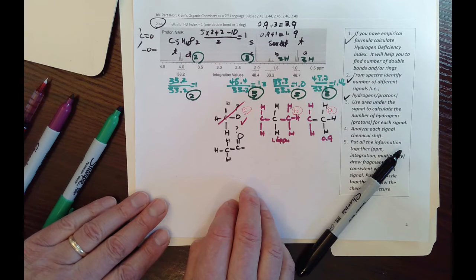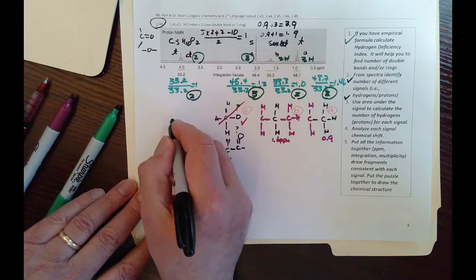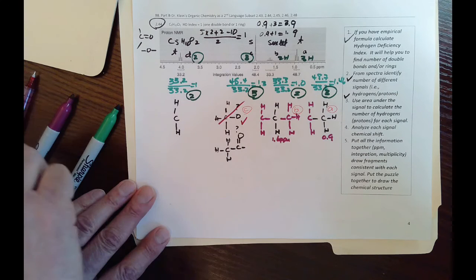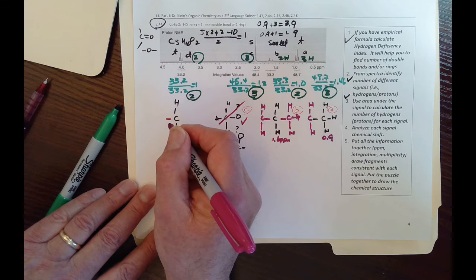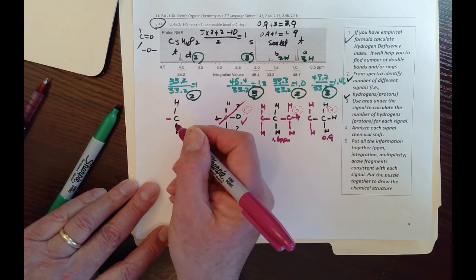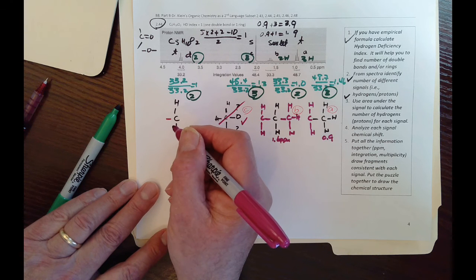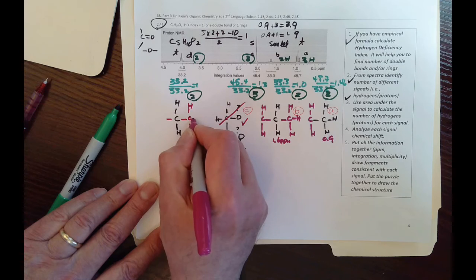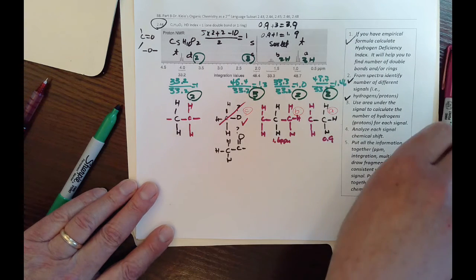Now we're going to look at the D. So D is 2 hydrogen, but it's split in 3, so it's a triplet, right? Next to it we have 2 hydrogen, and it's very downfield. It's 4. So it's going to split in 3, a triplet. So this is my D.